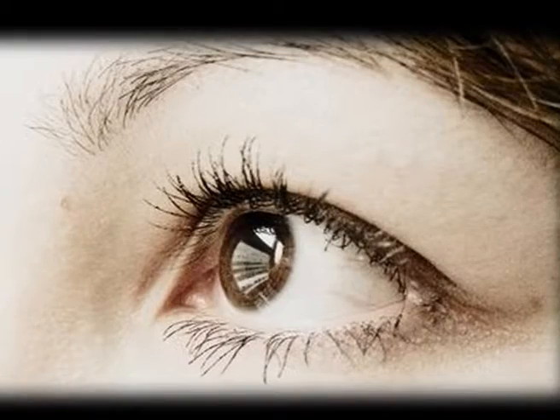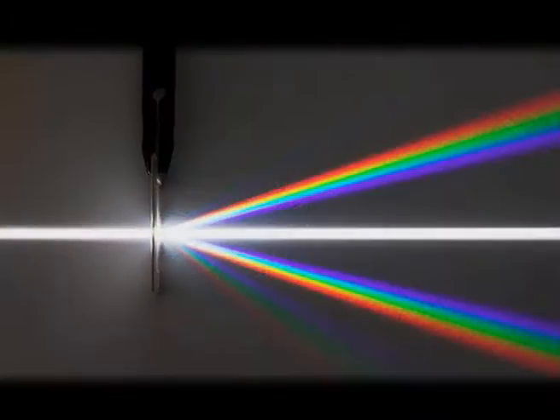Now, coming to how light is perceived by the human eye. What an eye can detect is actually the difference in the intensities of light, which is known as contrast. That is, the intensity of light from an object versus the intensity of light from the surrounding medium.